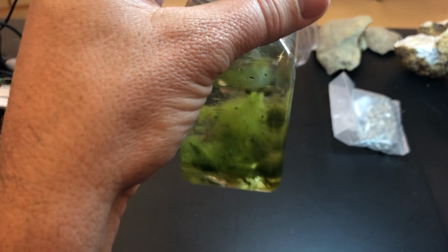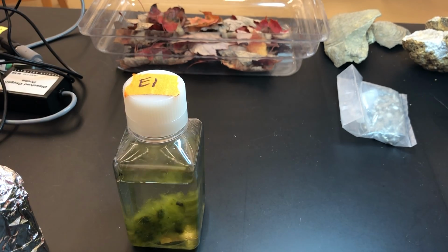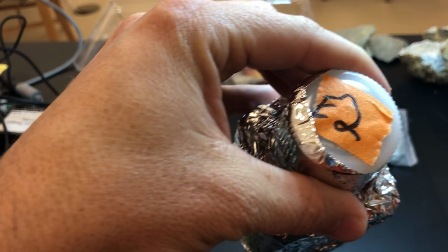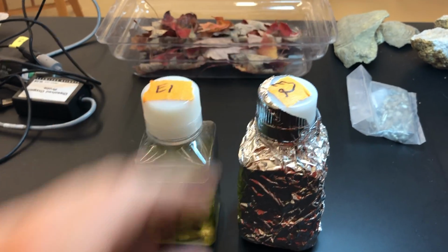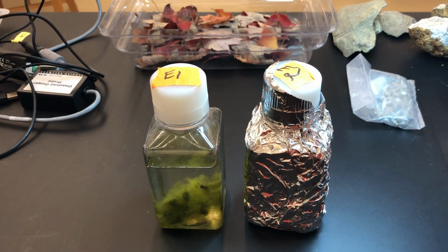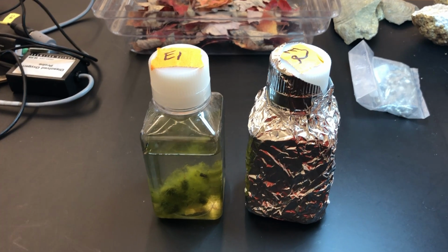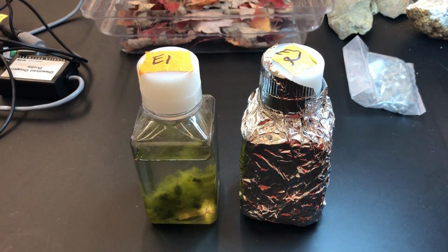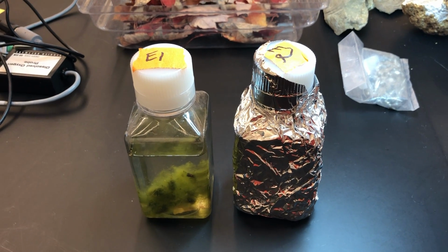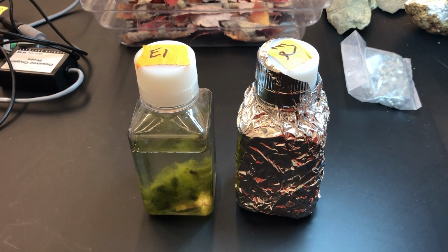So I prepared one, and it's in this clear container. And then sample number 2, or treatment number 2, is in E2, and it's the exact same container. But in this container, I covered it with tin foil, so it's completely opaque and it cannot receive any sunlight. Without sunlight, I can do no photosynthesis. So although the algae is there, it's not going to be producing sugars as a product of photosynthesis. It's only going to be doing cell respiration.